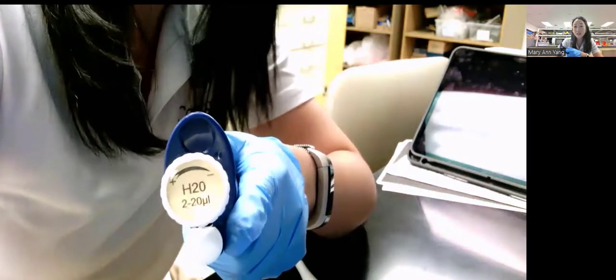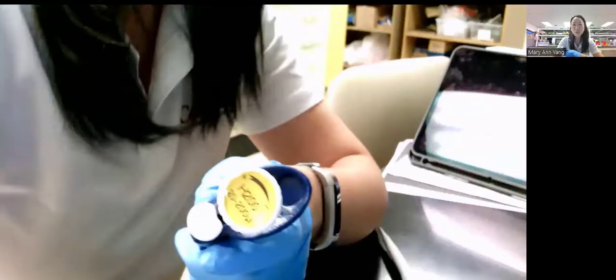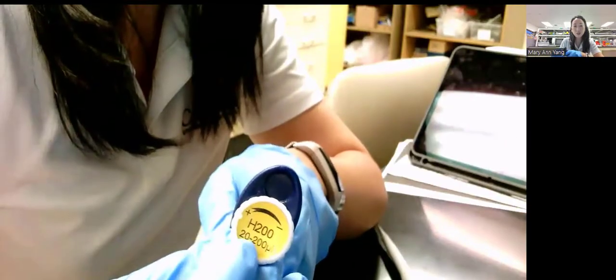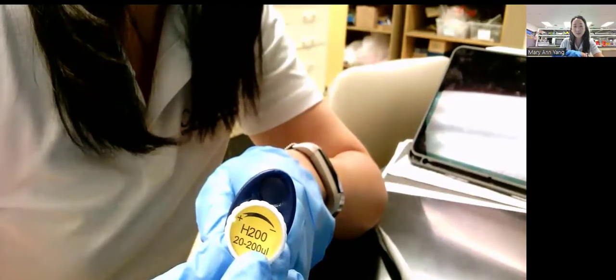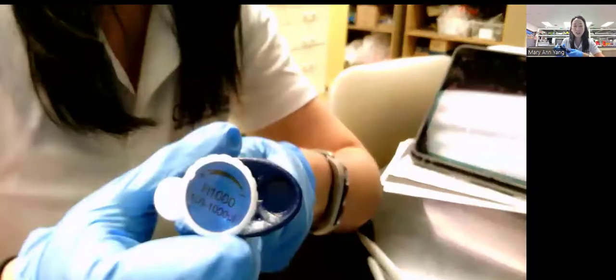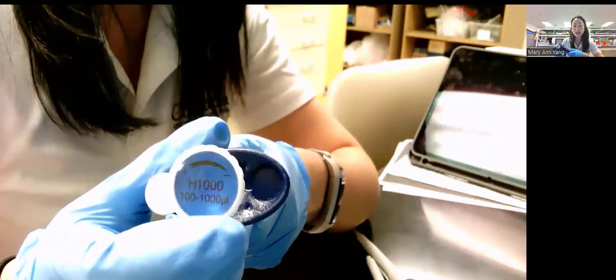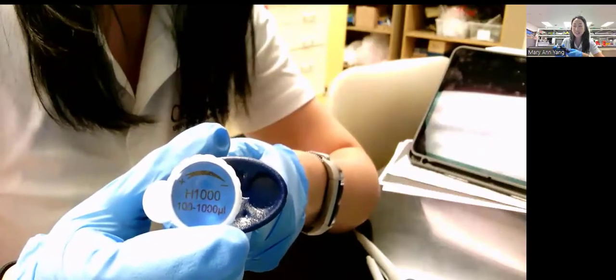So this means a millionth of a liter, a very small amount. Next is P200, which measures the median amount, between 20 microliter to 200 microliter. And the last one is P1000, which measures from 100 to 1,000 microliter.